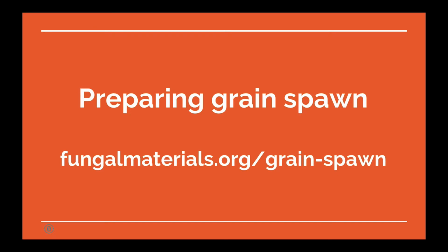Now we're going to talk about preparing grain spawn. I'm putting up more details at fungalmaterials.org/grain-spawn. This is what we will use to inoculate bulk substrates with fungal mycelia. This is the first step in growing myceliated materials like structural bricks or insulation, and in some applications potentially we'll be using grain spawn to make mycelial textiles as well.